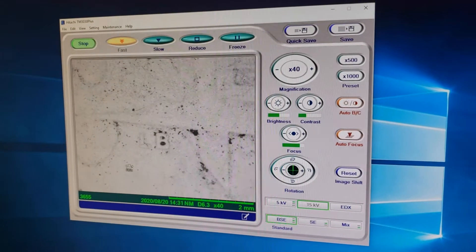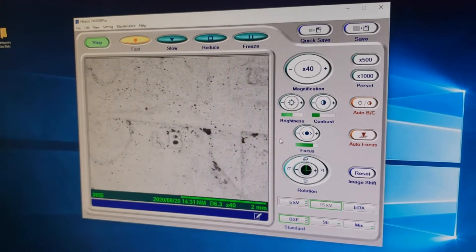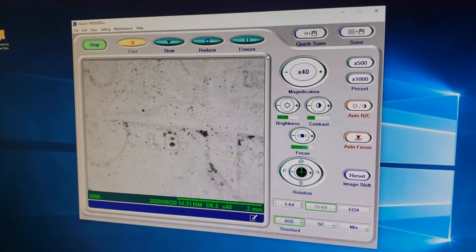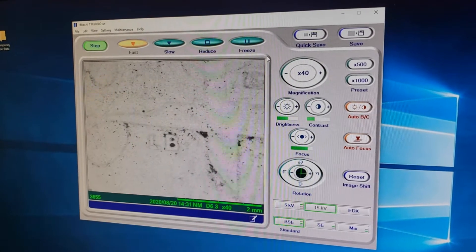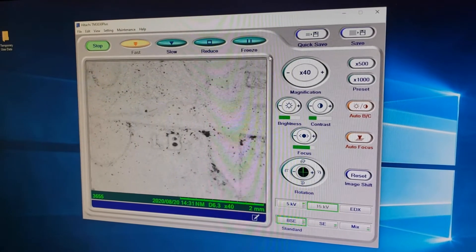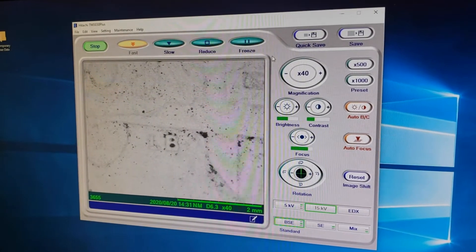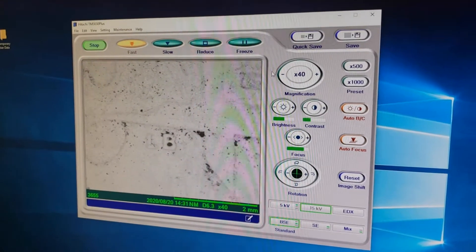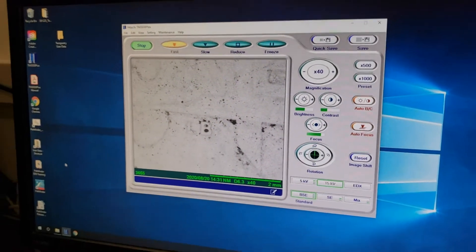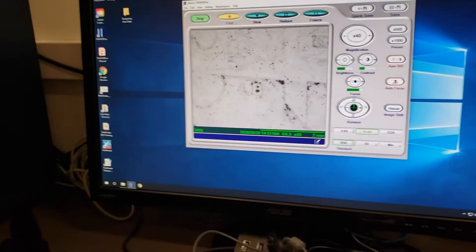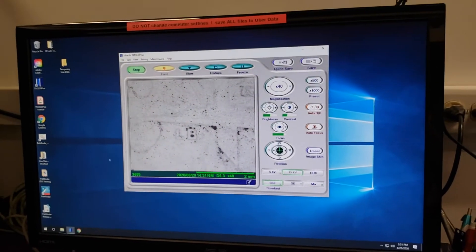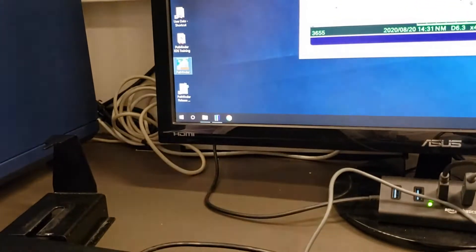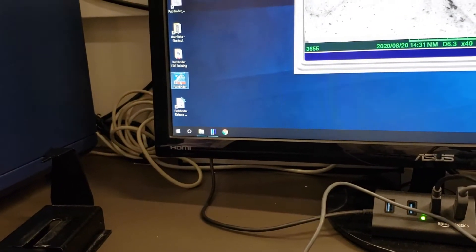If you are trying to do an elemental analysis or use EDS — also called EDX, EDAX, EDXS, etc. — after having positioned ourselves properly, we are going to open up Pathfinder. This is another software here on the desktop called Pathfinder.